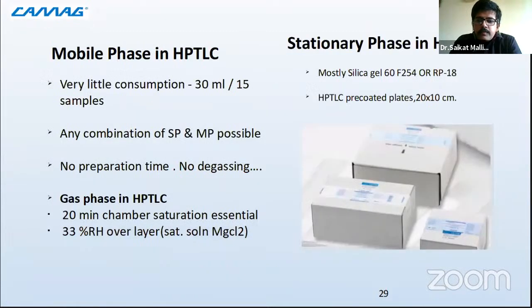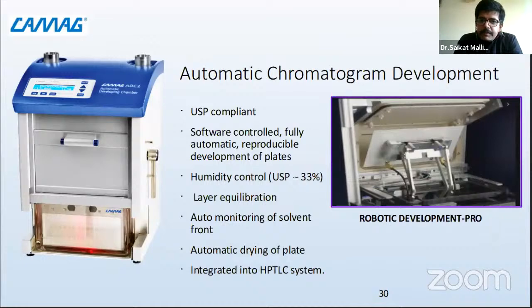Then you have some summary, like for the first few slides which we went across, and quickly, these are some of the stationary phases and mobile phase combinations which can be used. No preparation time, no degassing. What you see is a typical stationary phase plate box over here. And from that, we take the stationary phase, and each time when we want to do a fresh analysis, we do it from that. Then these are developing devices.